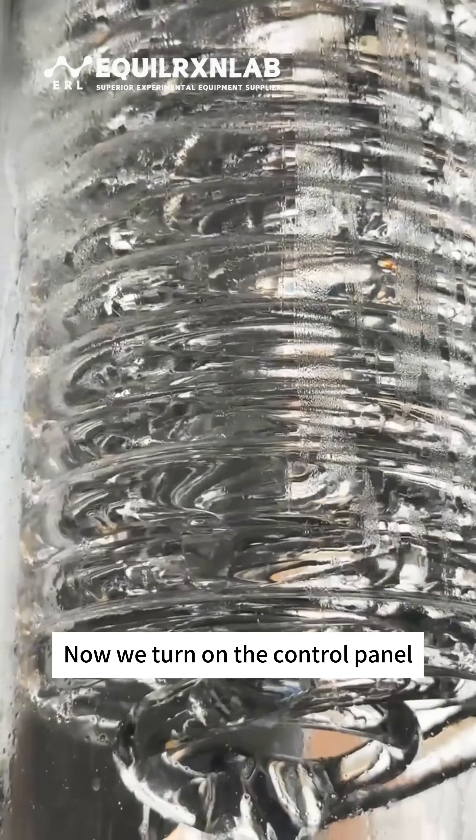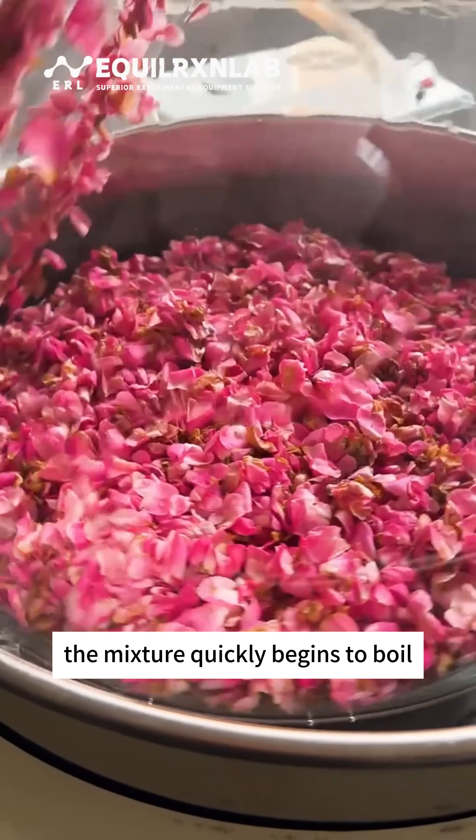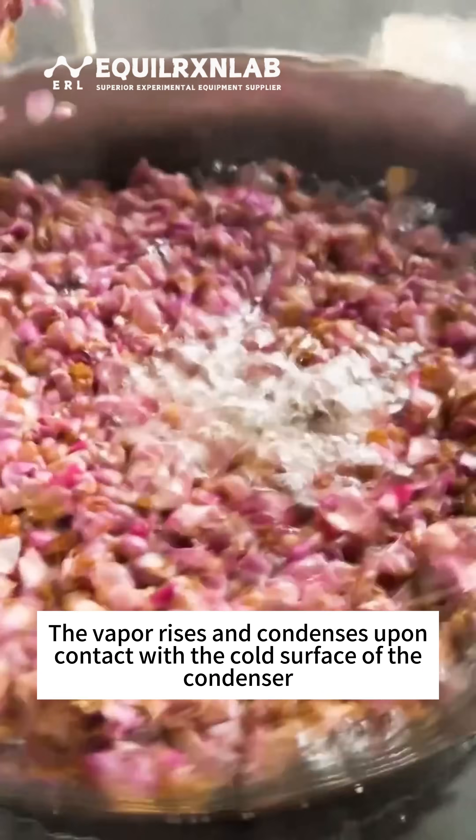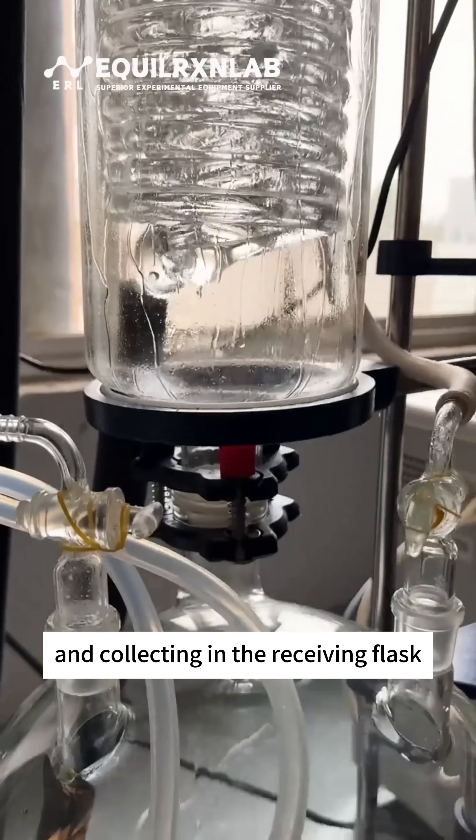Now we turn on the control panel to begin the rotation of the evaporating flask. Under reduced pressure, the mixture quickly begins to boil. The vapor rises and condenses upon contact with the cold surface of the condenser, turning back into liquid and collecting in the receiving flask.